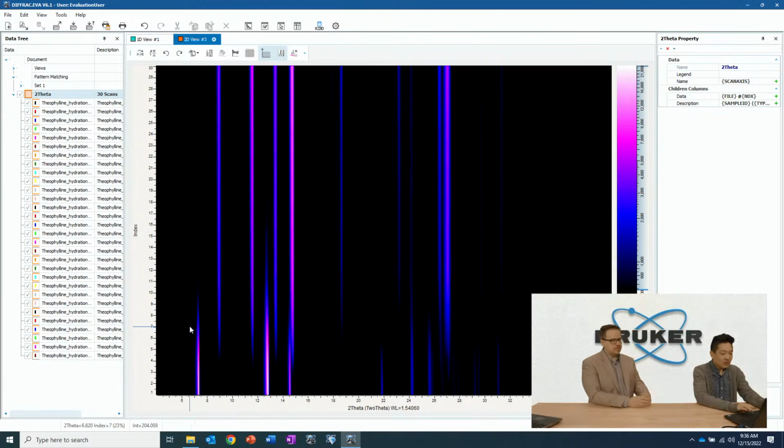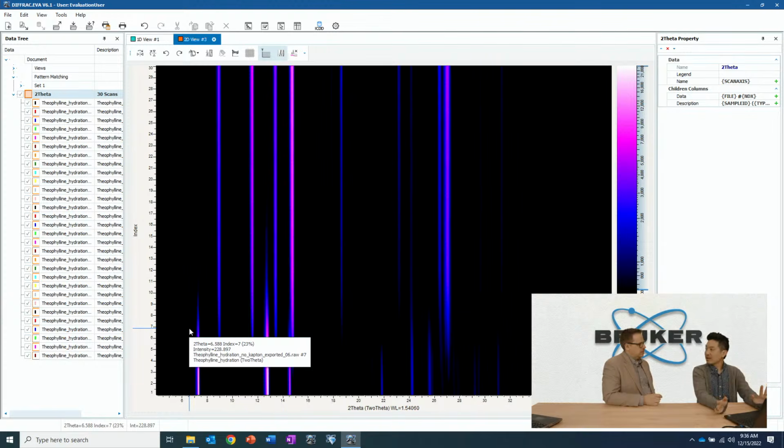And it's kind of cool to see how long they persist. We actually had this intermediate region here where you see persistence of both materials. So it's not like you turn on a light switch and it's just boom, one material or another. It slowly starts to convert over. Over the course of 1, 2, 3, 4, 5, 6, 8 scans times 2 minutes, so over the course of 16 minutes, this converts over from one form to the other.